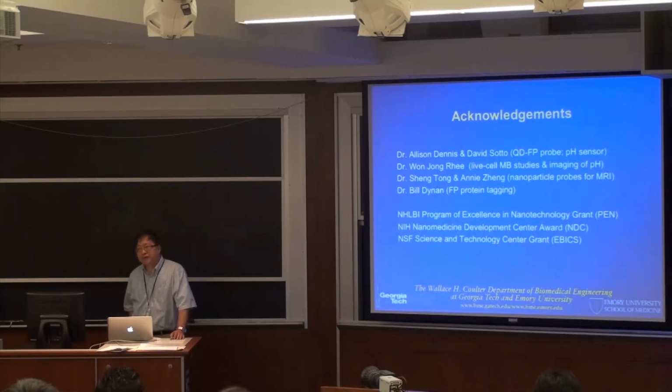Yeah. So most of the work so far with protein tagging, they try to use things like zebrafish, right, to study development because it's transparent, right? For some of the studies, unless the tissue itself is transparent, you would have the same issue, that is the limitation of light penetration, right? Also, there's a potential cytotoxicity if you shine light for too long, right? So there are different challenges. I think one of the major challenges is that in that case, you have to use things like fluorescent protein.